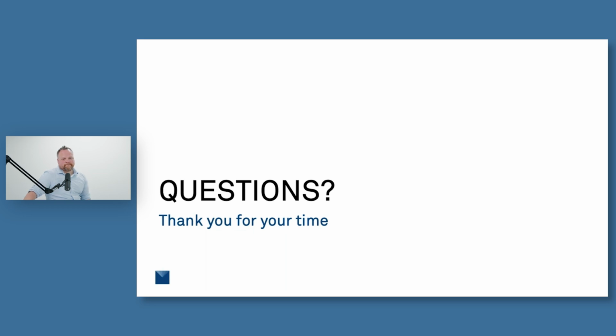Let's see here. This next individual is asking, so you had mentioned there at the end, that last slide, talking about the standards, and they're asking about sample sizes, and can they use different sample sizes, or does it have to be using the official sample ring that comes with the instrument?